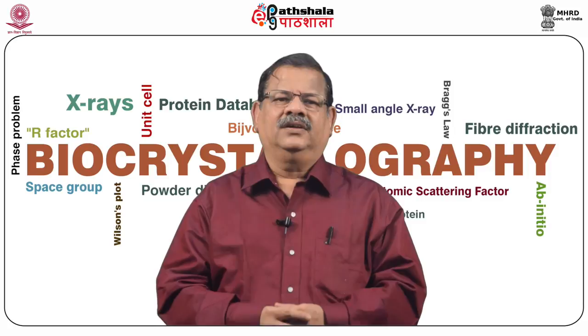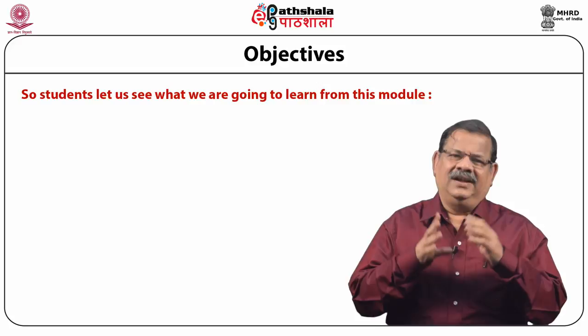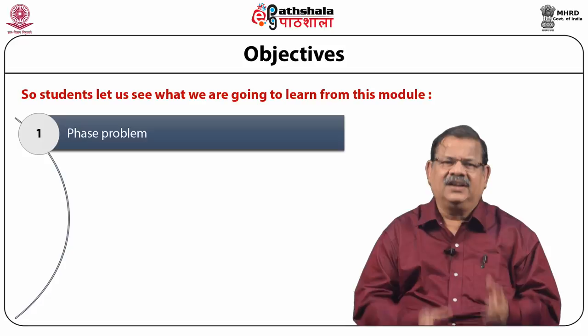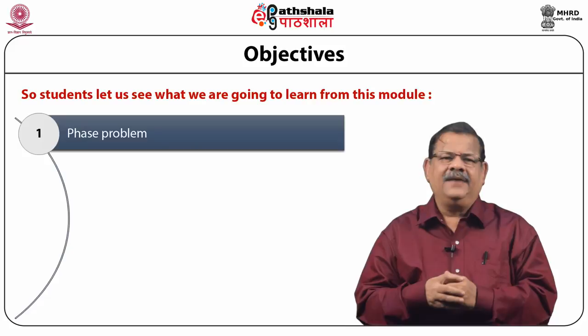So, students, let us see what we are going to learn in this module. First of all, I am going to explain briefly what is meant by the phase problem, which is a bottleneck in X-ray crystallography, and I am going to deal in depth with what we mean by direct methods.